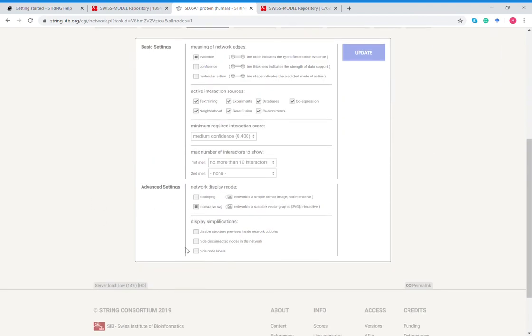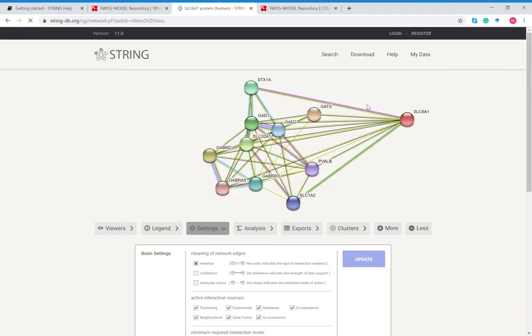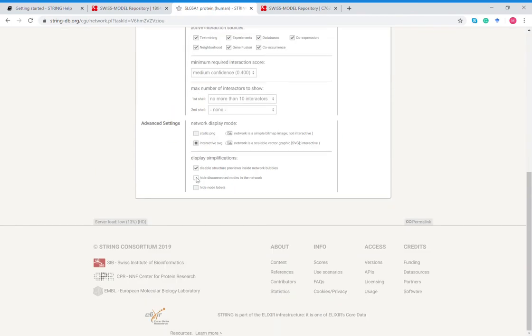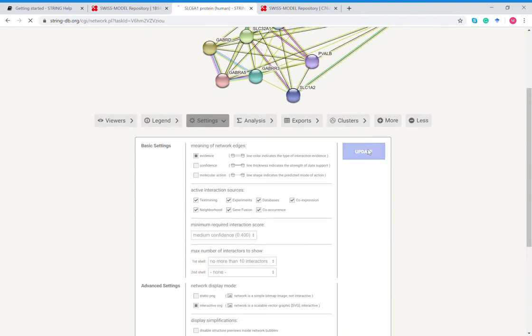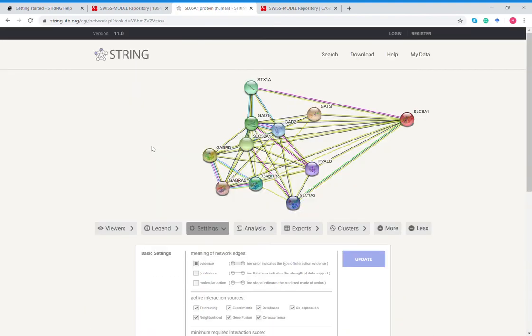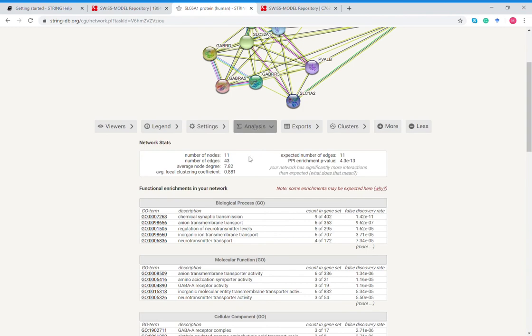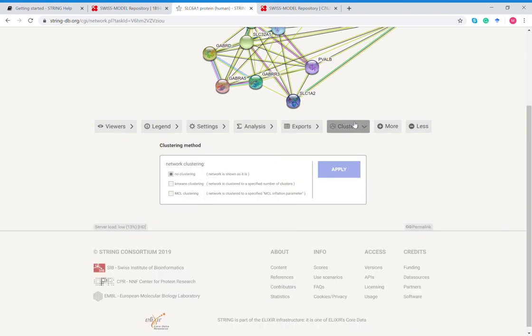Display simplifications, you can disable structure previews inside network bubbles so they're all empty. I prefer the 3D views just because it makes a pretty picture. And then the clusters, you can cluster by no clustering, k-means, or MCL.